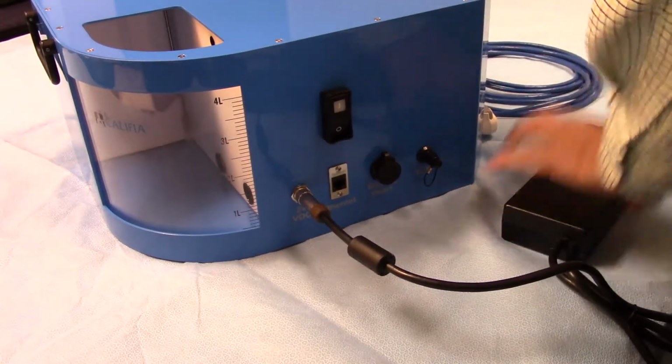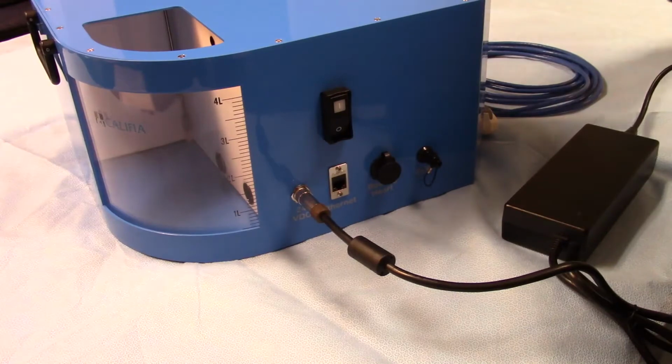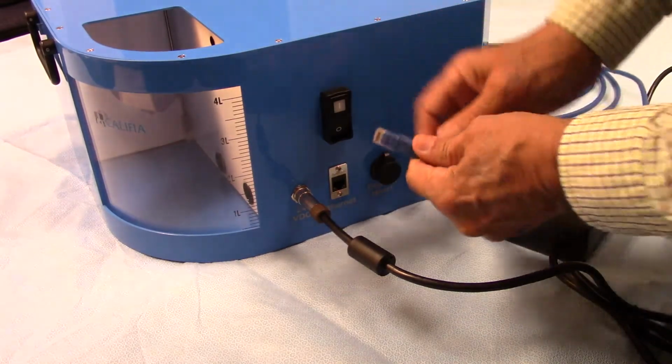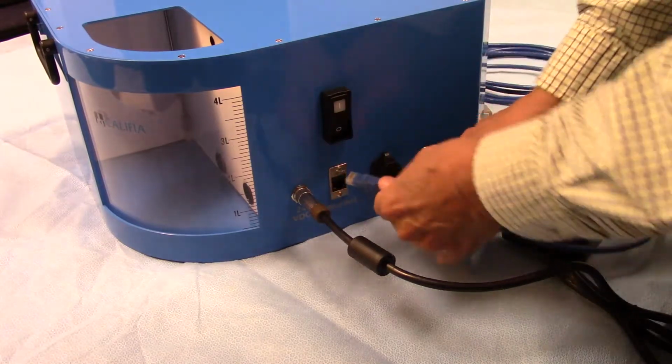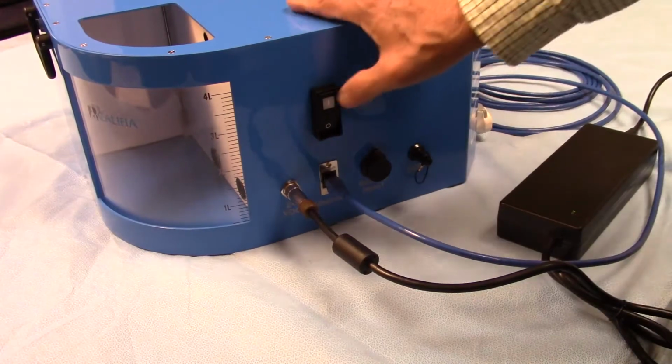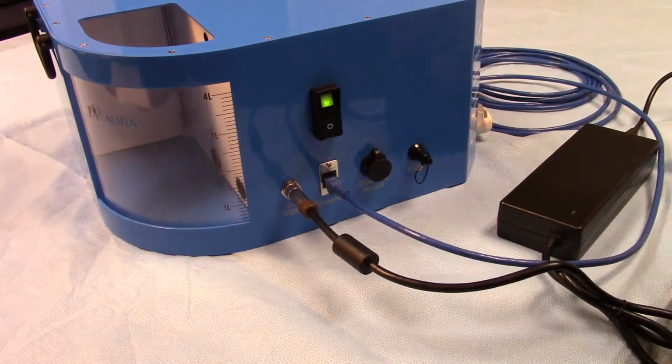The next thing that we'll do is to attach the Ethernet cable. The Ethernet cable, of course, has a catch that's on the downside of this connector and goes straight in and clicks. Lastly, then, we'll go ahead and turn Califia on.